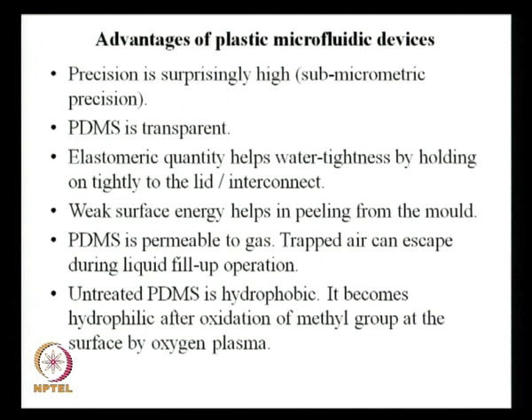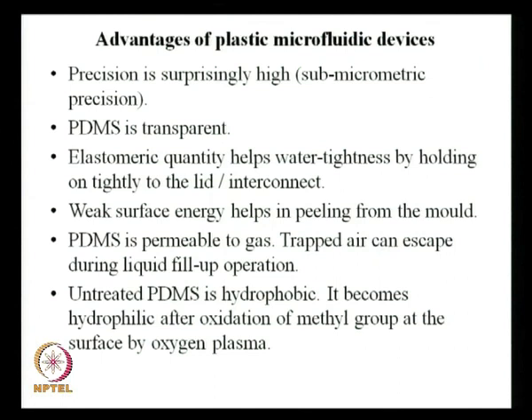Now, what I learned is that PDMS is permeable to gas, so if there is any trapped air inside the channel when you fill it with a liquid for the first time, this air can permeate out of the PDMS layer, and the liquid fill up operation will have less hindrance.